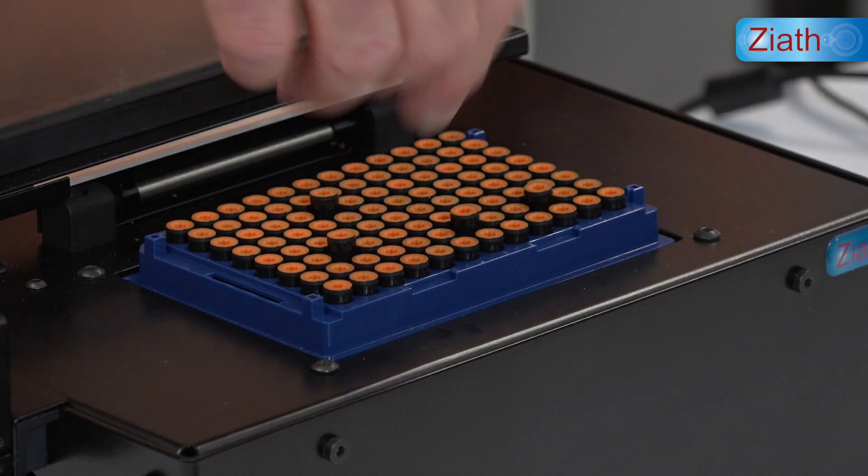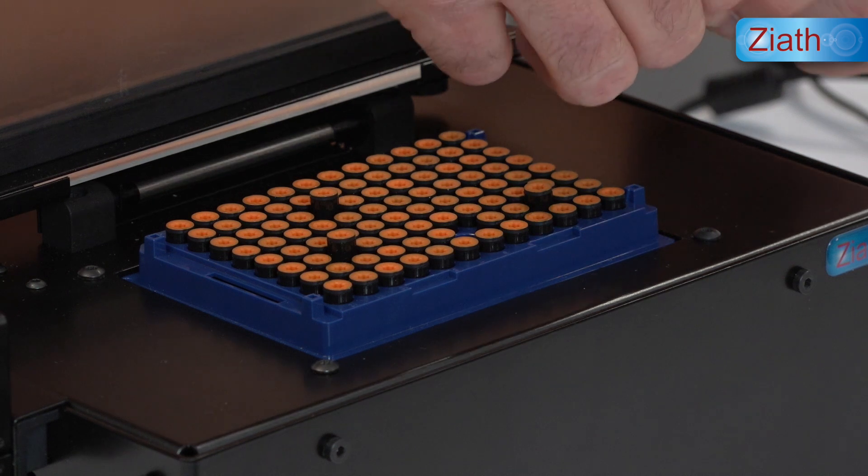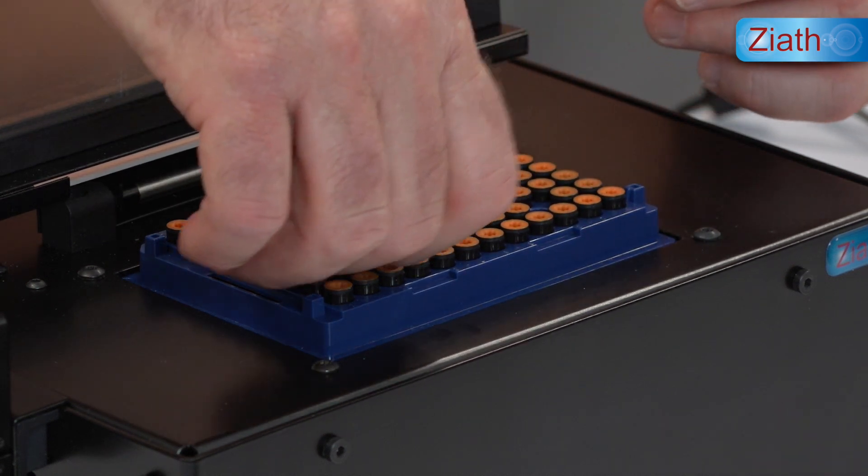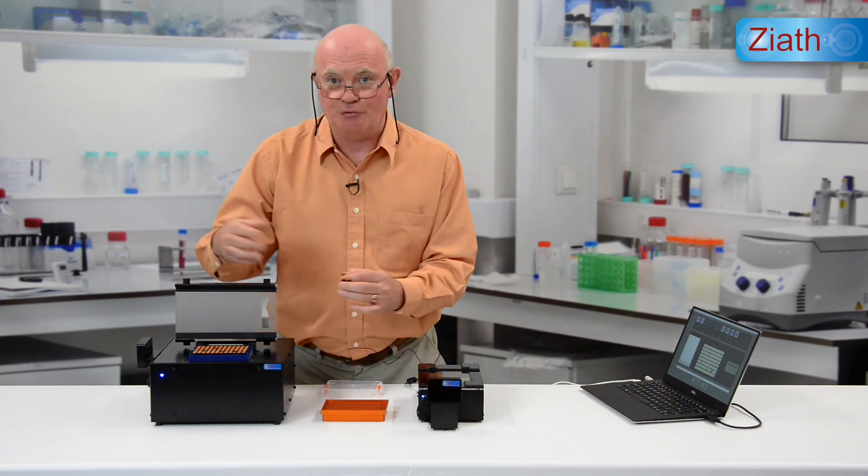the appropriate acoustics tubes have been raised and we can easily remove them from the rack.